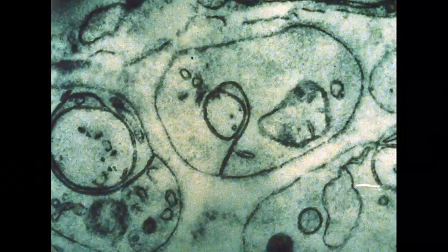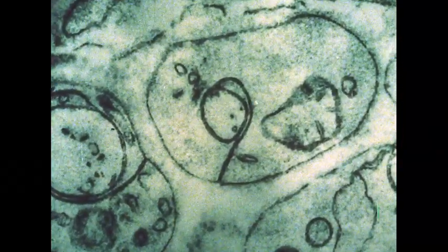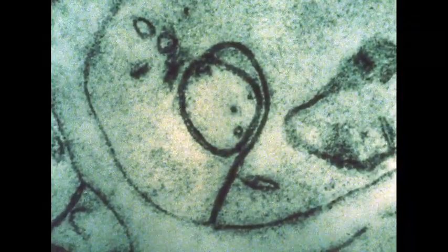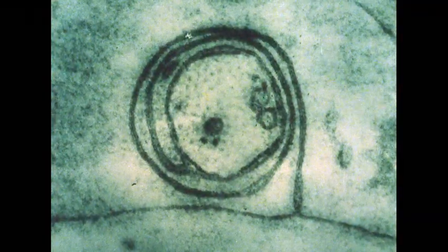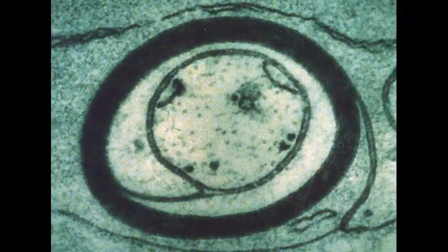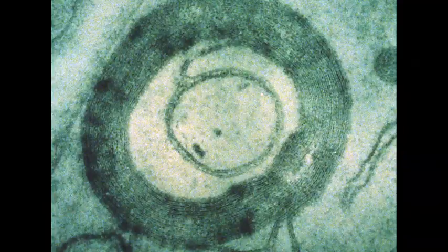Thin tissue sections allow the botanist or the anatomist to observe structure and ways of growth. For instance, in the sheath round the fibers of the sciatic nerve. In a 4-day-old mouse, the cell membrane appears to be folding inwards around the nerve core. As the mouse develops, this spiral loops and loops again. By 16 days, the protective covering is tightly wrapped about the nerve itself.